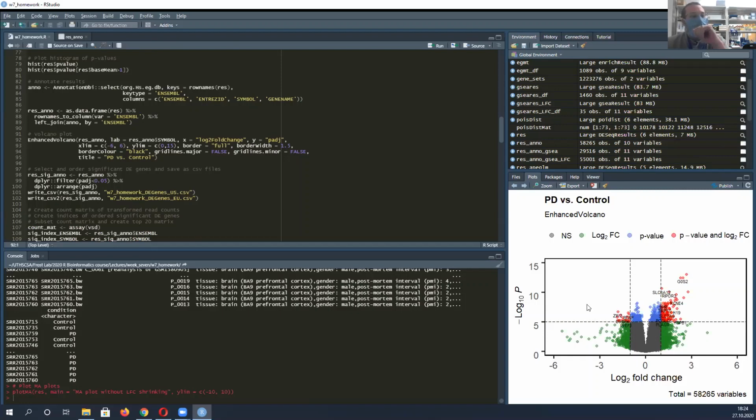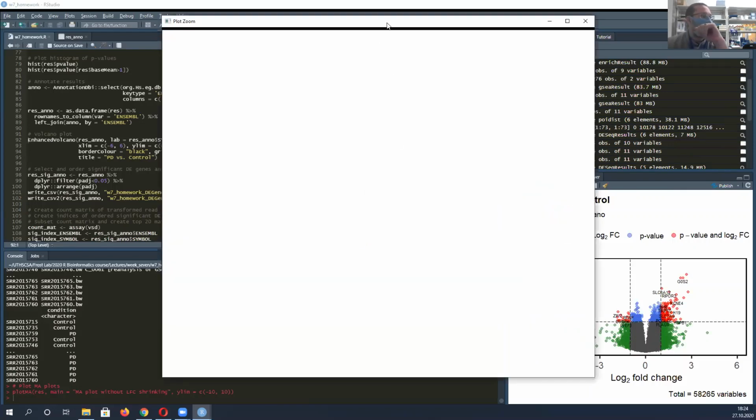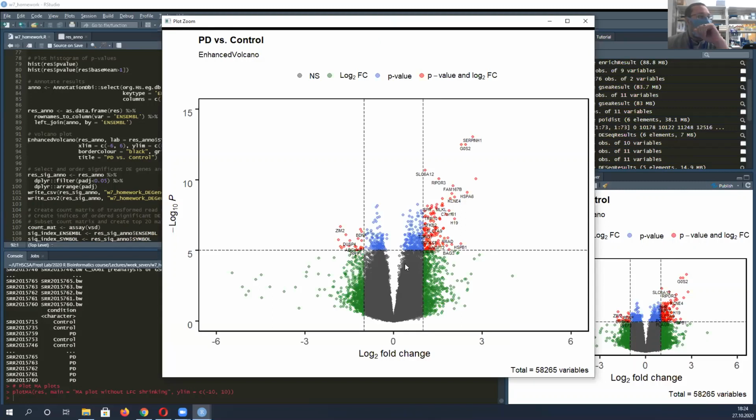So I didn't really play with these cutoffs too much because, if I open this up bigger, I didn't really see any populations that distinguish themselves that would lend themselves to being like, oh yeah, clearly the cutoff needs to go here or there. This all seems to be pretty continuous. So if I put my line here or here, I didn't see that I was going to do anything objectively reasonable, so I just left them where they started. Also because this was for homework and not for publication, so I didn't have an informed opinion on what I wanted to see and show.